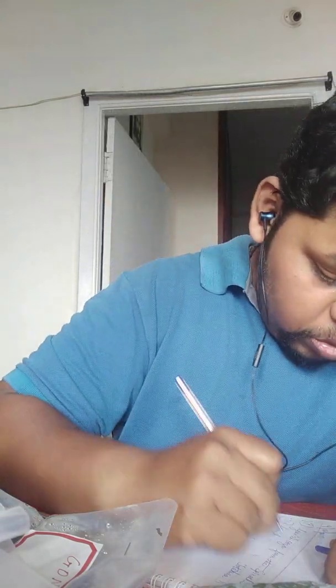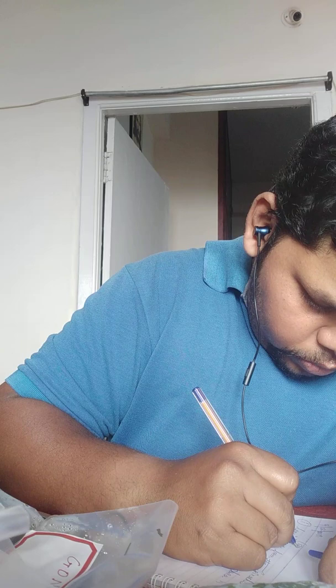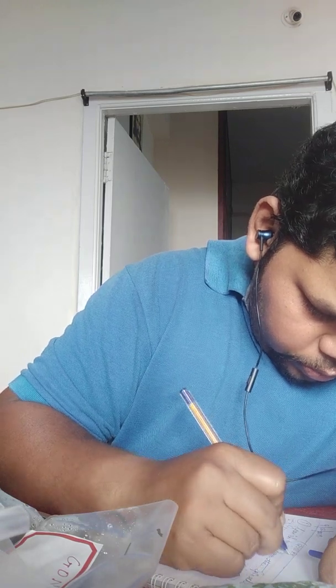Sample observations are taking place. The record started at 11:56 a.m. Monday morning, around 9/12/2019, and the observation has taken place around 12:01 p.m. IST, Indian Standard Time.